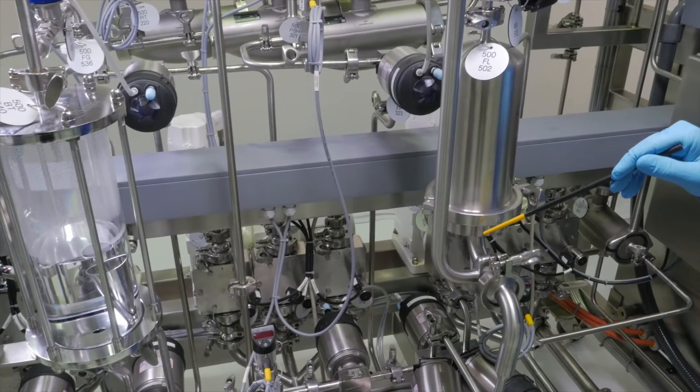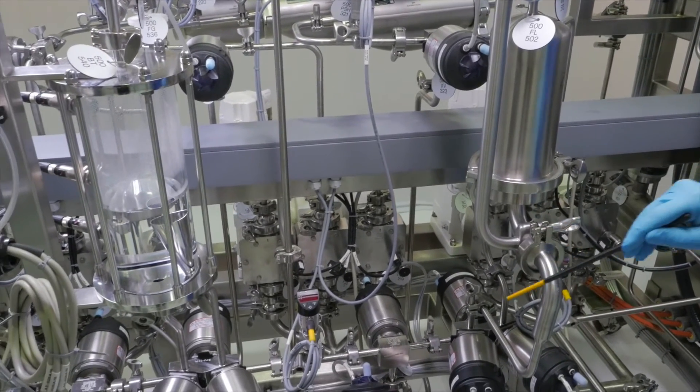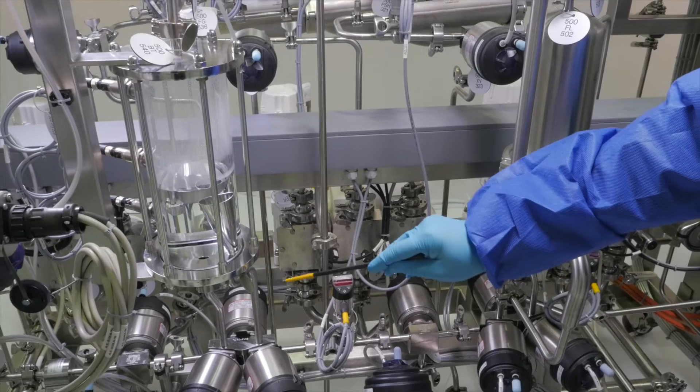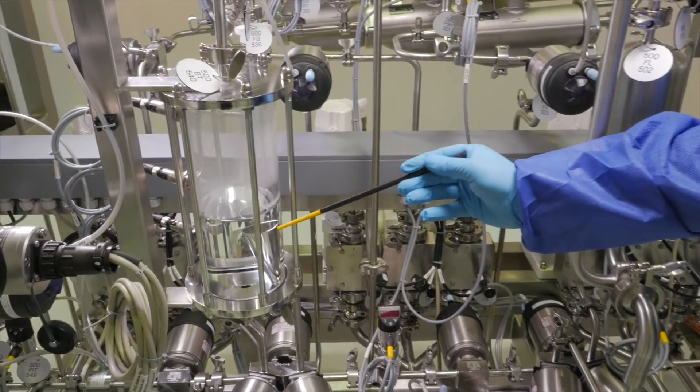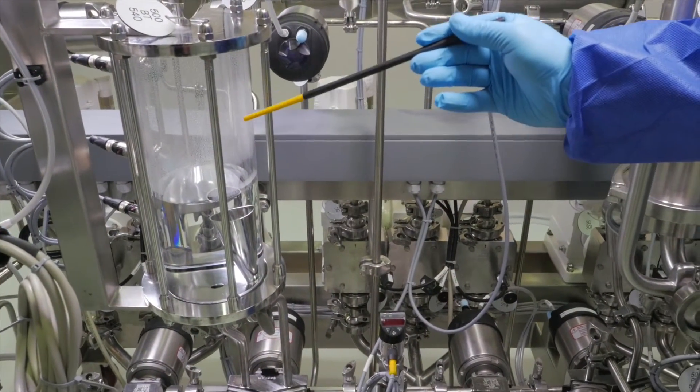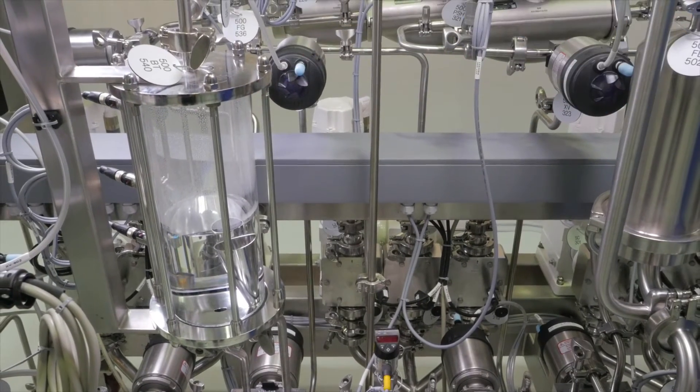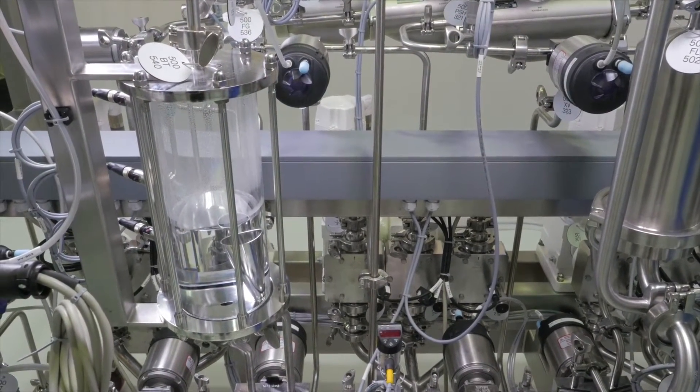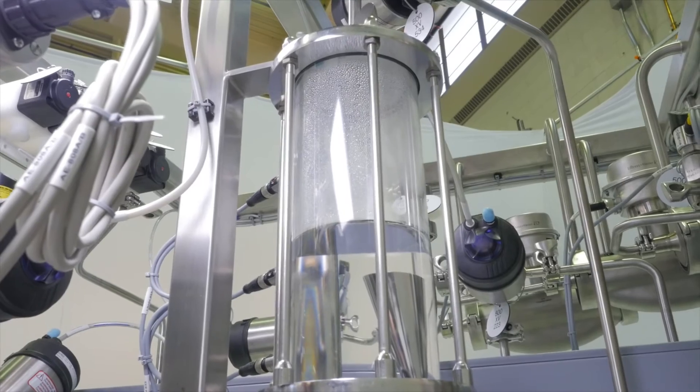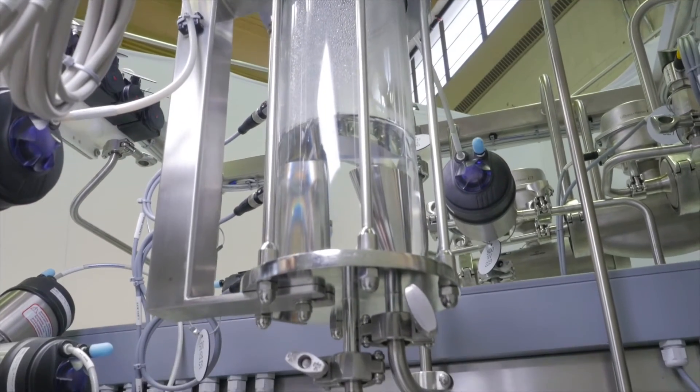An optional pre-column filter protects the column from any particulates in the incoming process fluids. Our bubble trap option removes air from the system that could negatively impact the chromatography. The bubble trap can be isolated from the process flow when sending protein feed directly to the column.